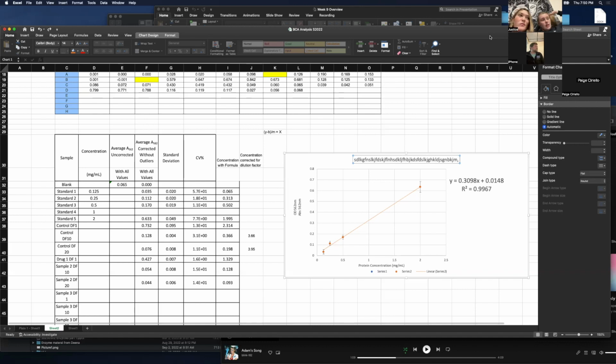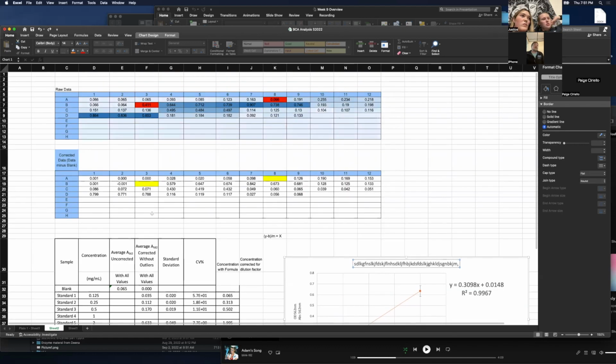And you said that if we had an outlier, because we had one that had an issue, just delete it off of our corrected chart. Yeah, yep. Highlight it in yellow so that when you copy and paste the data into your notebook, I'll know that it's an outlier. I think I marked most outliers when I saved the data. Yeah, you marked ours.